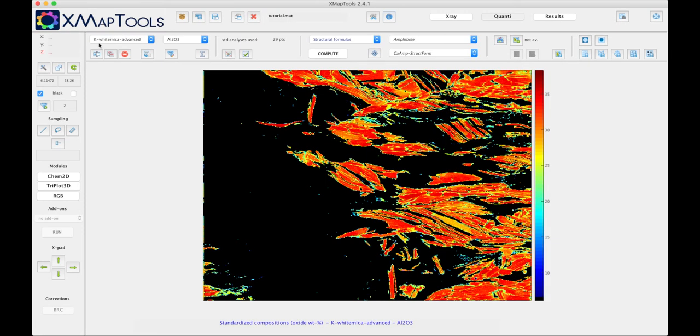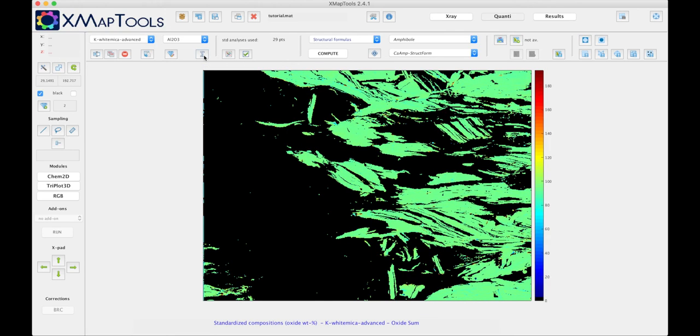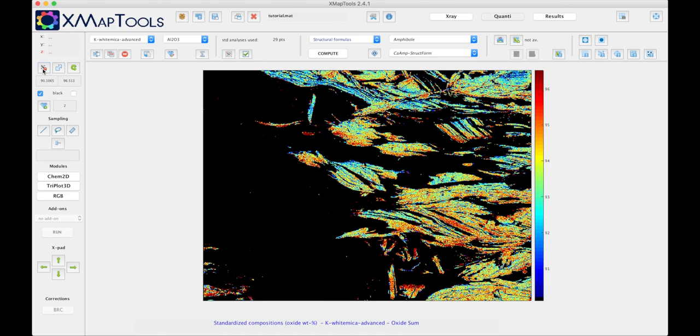Now I obtain a white mica advanced calibration and I can check that everything is fine by calculating the sum of oxide using this function and auto contrast. I see that the sum is between 91 and 96, what we would expect for this white mica.